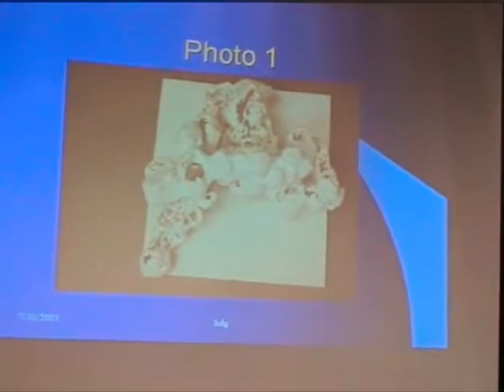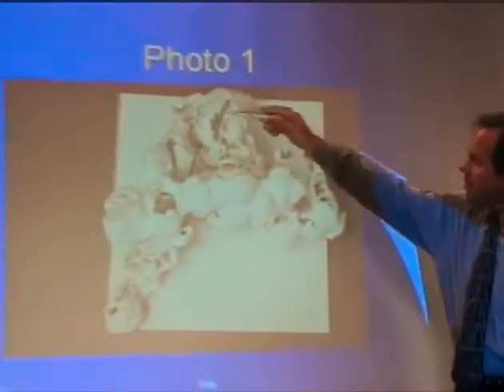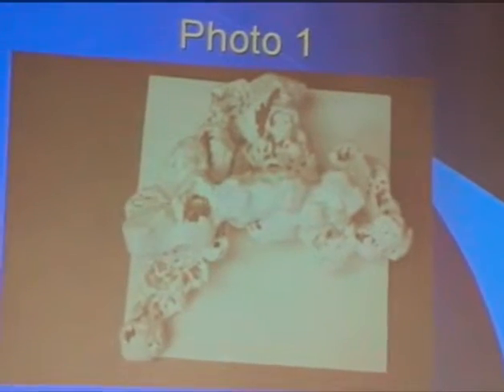Yeah, so here's a picture, and again, it's about the size of that printer, and you can see a whole bunch of very interesting details. Now, you could sort of guess from looking at a cross-section of this material that there was some porosity to it, but this helps you define the three-dimensional porosity. So we're very, very excited that we can get after the fundamentals of what's happening on porous solids at the nano level. Now, this is all one material, that's all carbon, so it's one color of the polymer.